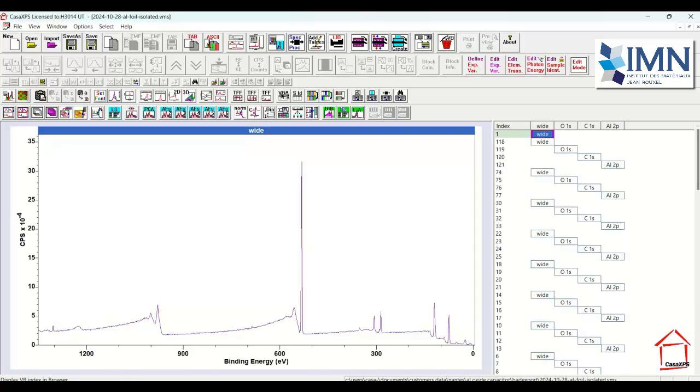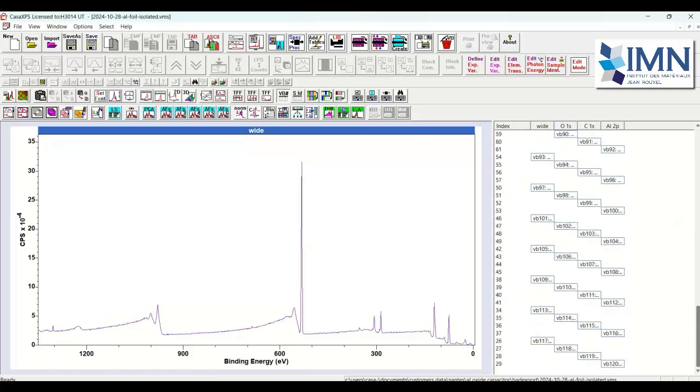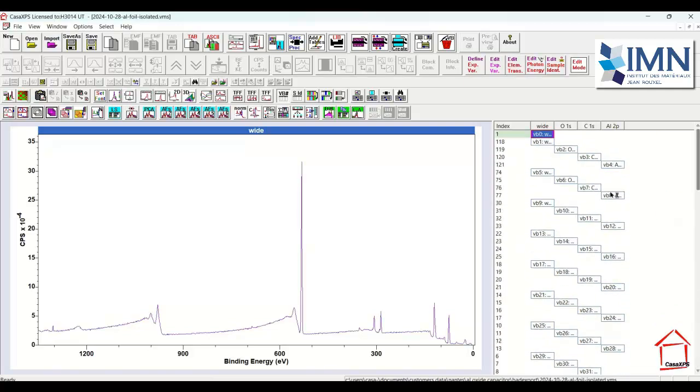You can see what the new VAMAS block order is still indicated by the VB hash option, so 0 through to the number of VAMAS blocks. So they're now the new order for this VAMAS file, and we can now save this and preserve the order according to the chronological order of when spectra were measured.